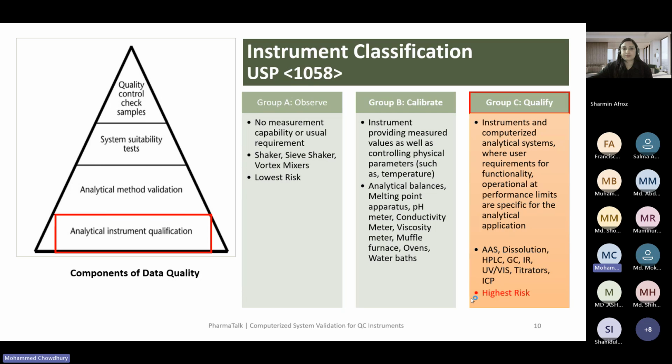If you have confidence in the vendor's quality management system, then you only need to perform the IQ for this system. If validation documentation from the vendor is available, fine, and if not, and if it is installed on premise, you need to perform the validation activities separately.